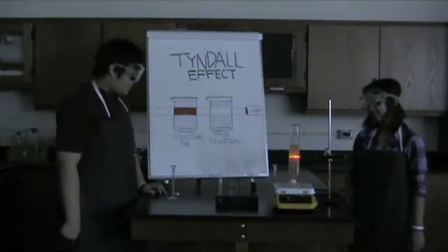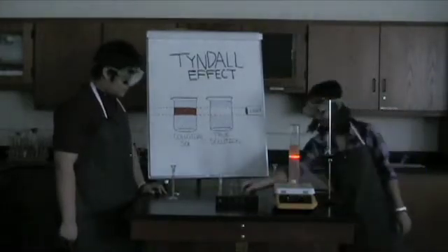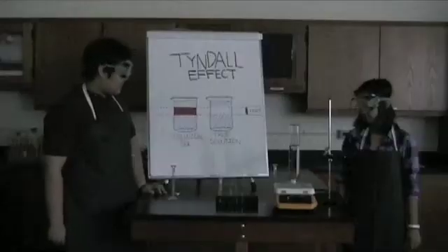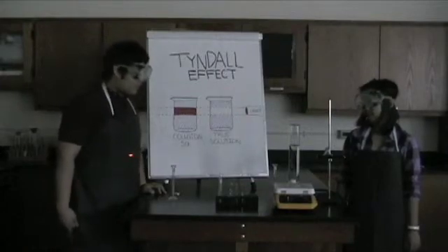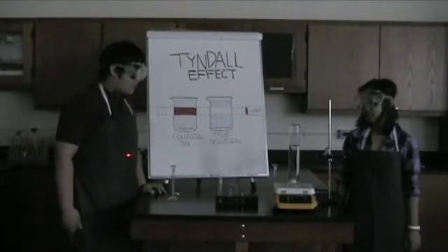Yes. If you think that's cool, let's add nitric acid. That's amazing. How did you do that? By adding nitric acid, I put more stress on the product side of the reaction, thus shifting the equilibrium to the left.